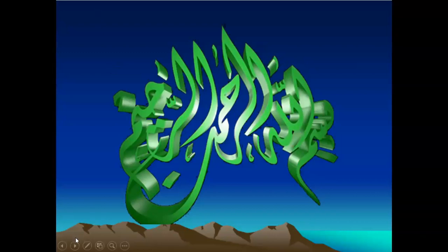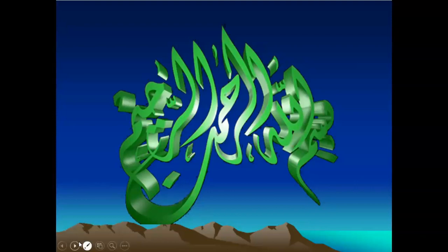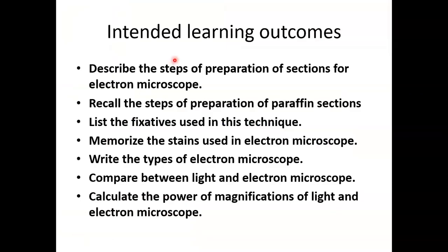Bismillahirrahmanirrahim. Today we are going to deal with the preparation of tissue for electron microscope. What are the learning outcomes today? Number one, to describe the steps of preparation of sections for electron microscope.